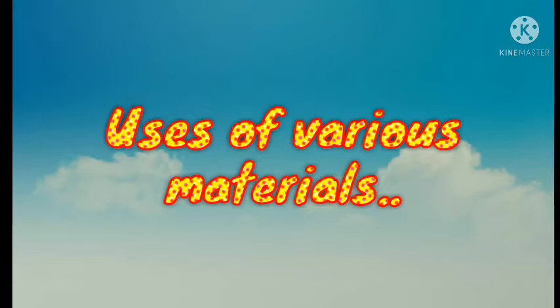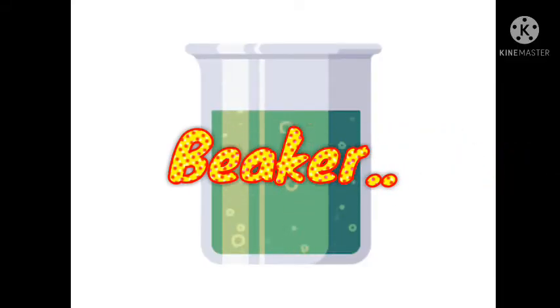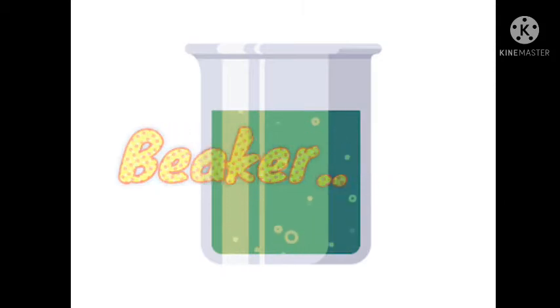Next, uses of various materials. The usefulness of these various materials. First, we start with the beaker. Beakers are used as reaction containers. They are used as a reaction container or to hold liquid or solid.